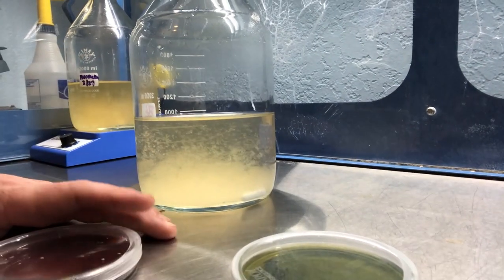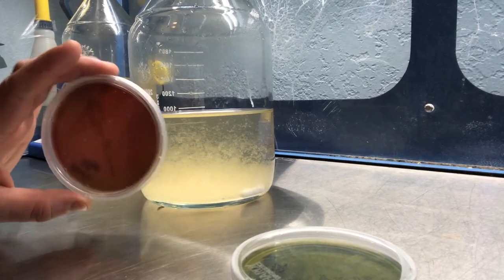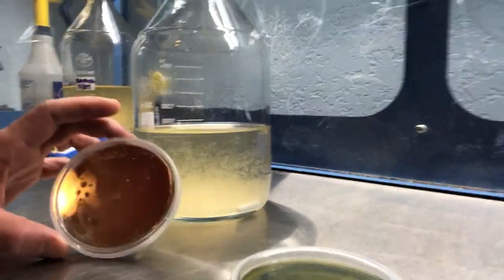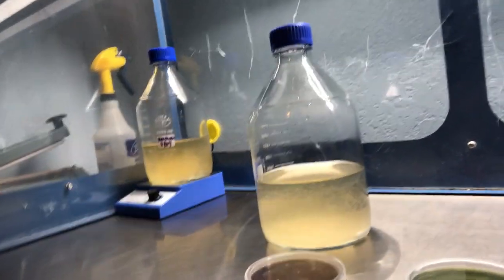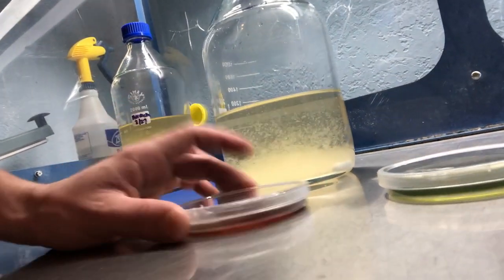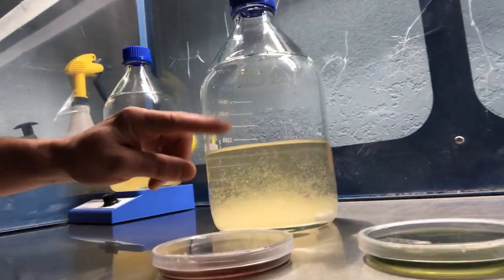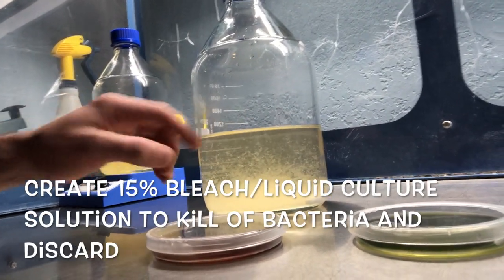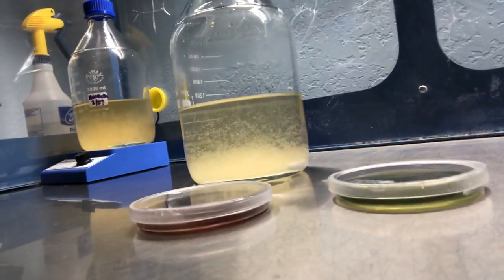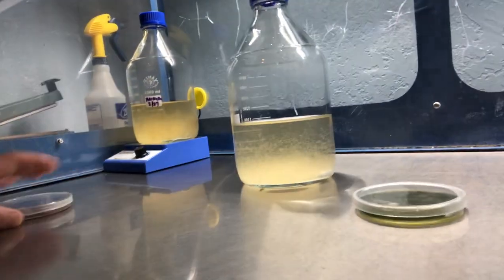It could be some Staphylococcus from my hands or my skin that got in there. Staph will grow on this blood agar plate, or it could even be some beneficial bacteria that I don't know about that lives in the cordyceps. Either way, I'm gonna go ahead and discard this liquid culture and start over. So what I usually do is just fill it up with some bleach, so it'll kill all of the bacteria that's in there, and then I'll dump it down the drain. But that's right here, showing the importance of doing the quality control.